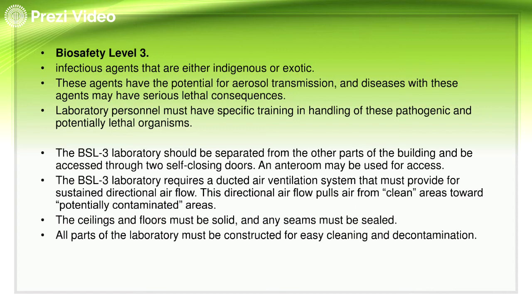When you say anteroom, ito yung hindi ka basta papasok sa laboratory. Kumbaga, bago ka makapasok sa lab, meron pang isang room na papasukan ka. That is what you call the anteroom. Okay? And then after nung anteroom, dun na yung laboratory. So, dapat medyo malayo siya sa other parts of the building kapag biosafety level 3. Kung pwede, may sarili siyang building, okay lang.